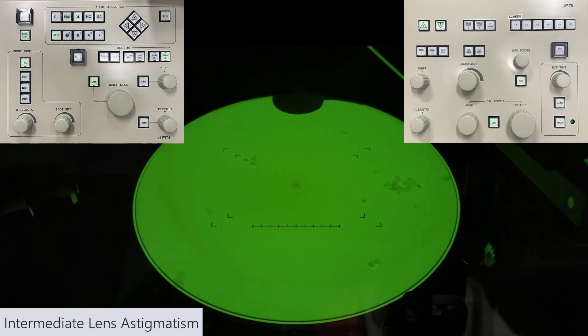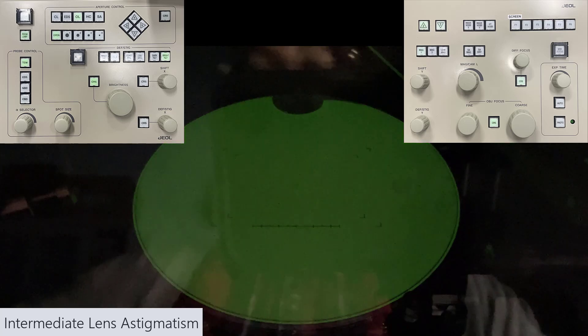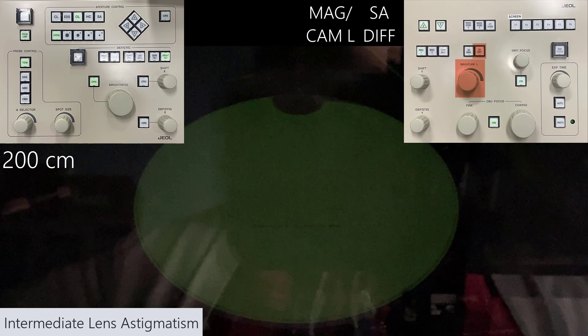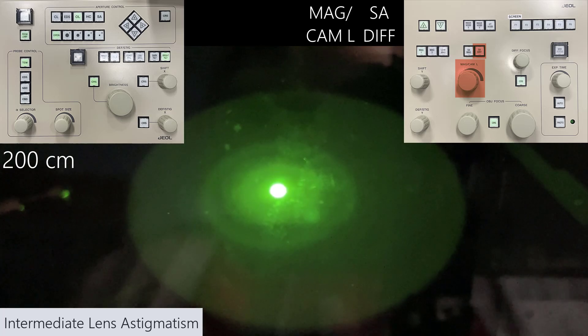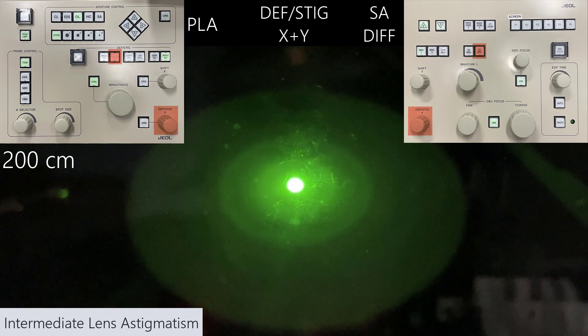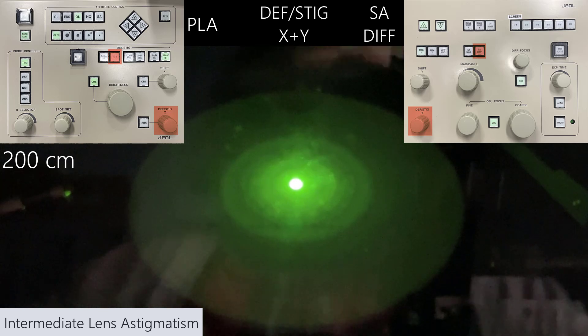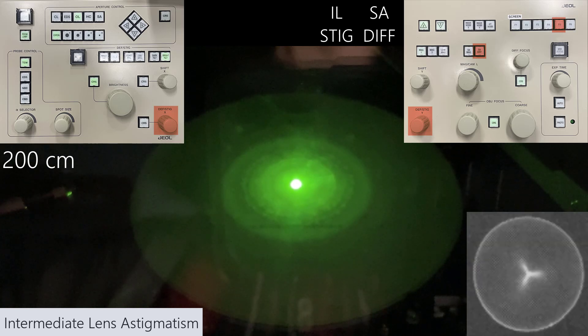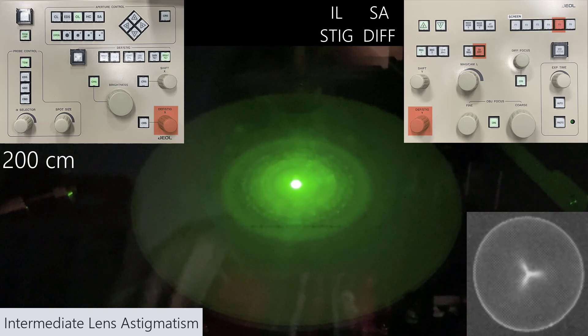In terms of required alignments, that's it. There are some optional alignments depending on what data you intend to collect. First, intermediate lens astigmatism — this is useful if you plan on doing selected area electron diffraction. Expand your beam so it's quite faint, switch to diffraction mode by selecting the SA diff button, and start at 200 centimeter camera length. Center your pattern using the PLA button and deflector stigmator X and Y knobs, sharpen the pattern using the diff focus knob, then select the IL stig — mapped to our F5 function — and correct the caustic spot using the deflector stigmator X and Y knobs.